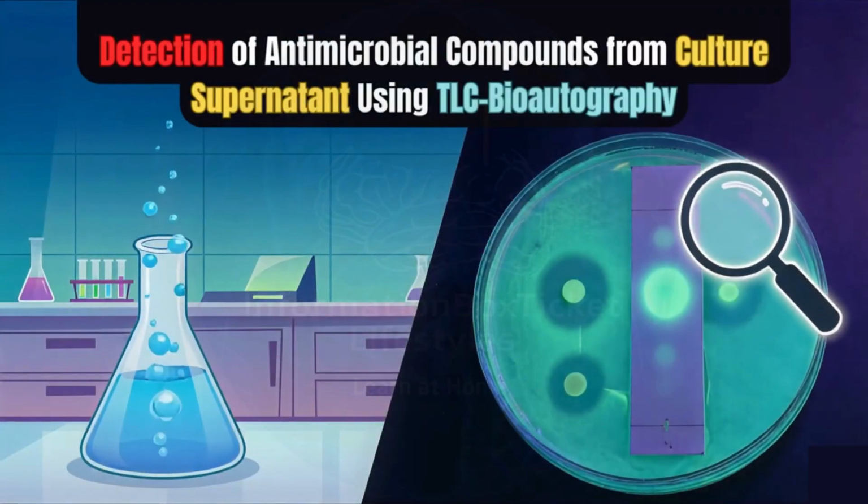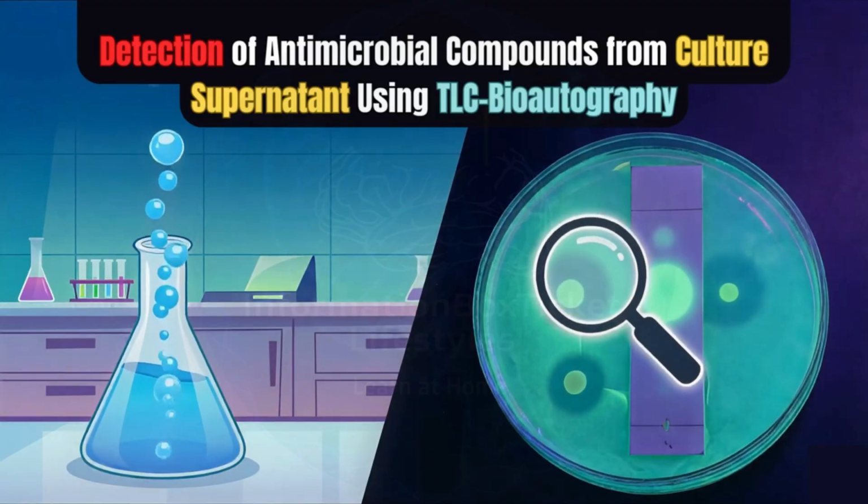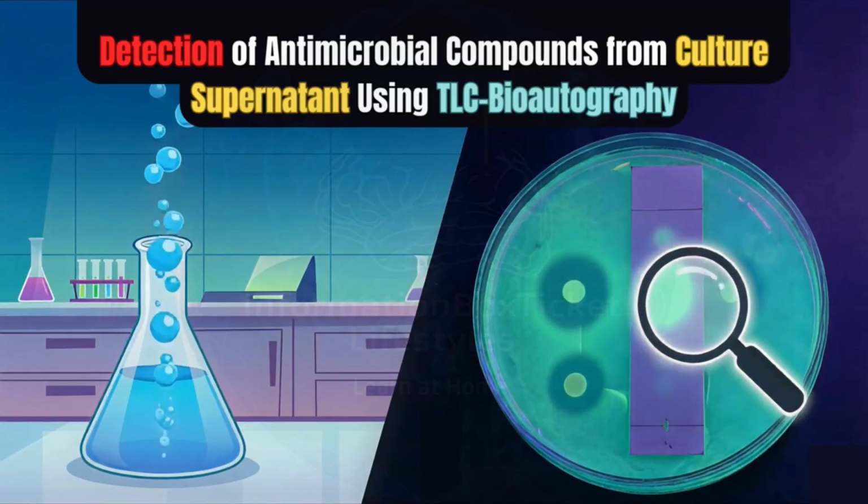Detection of antimicrobial compounds from culture supernatant using TLC bioautography.